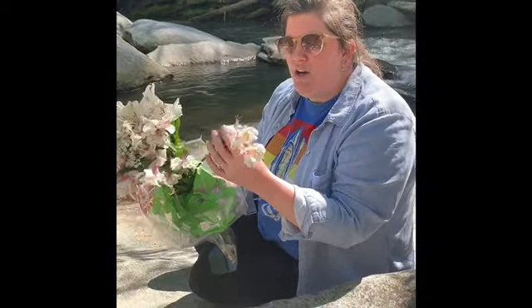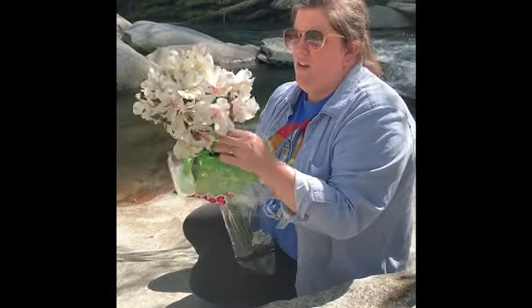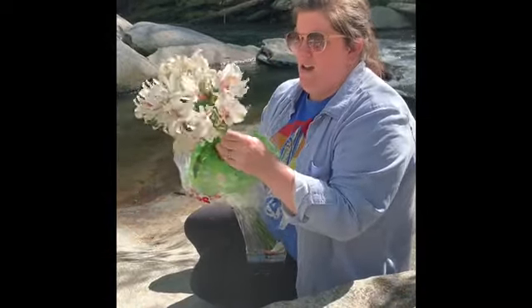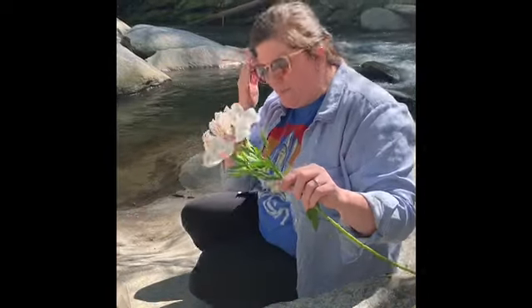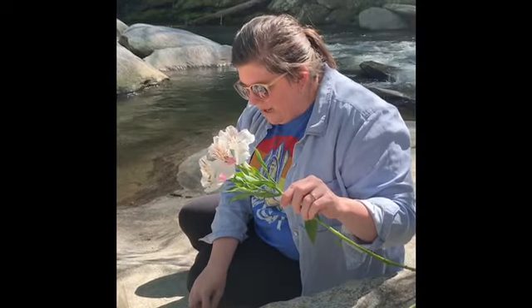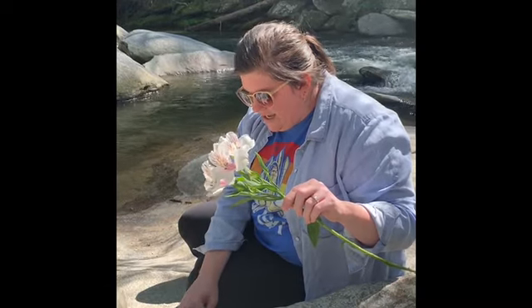But the first thing I'm going to do is take some of these flowers out of this bouquet. Alright, so I'll lay the rest over here. Okay, so what I want you to see is that we have lots of different parts to the flower.